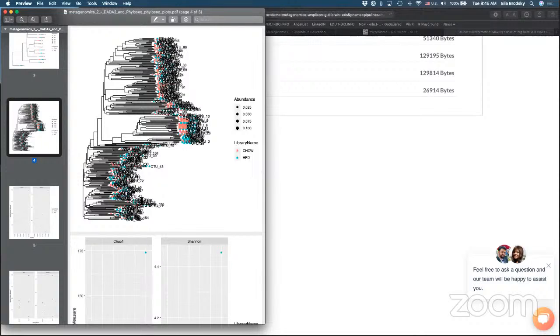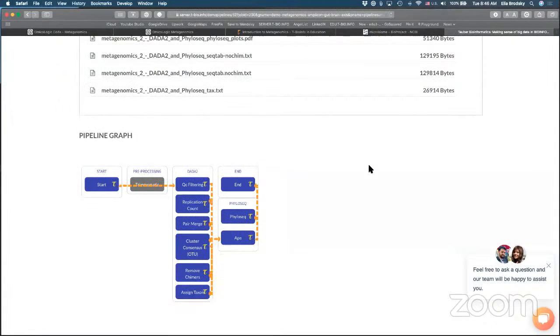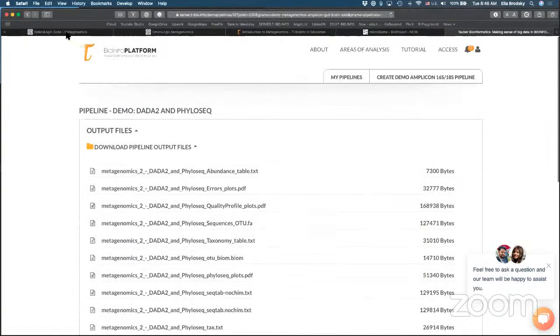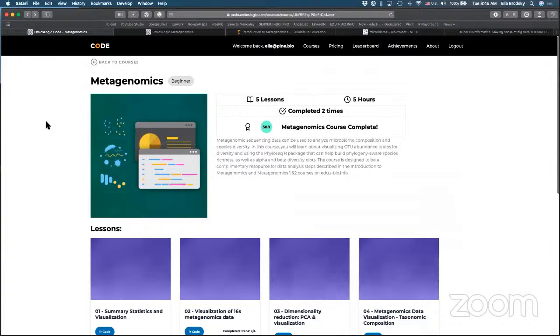This resource is a package in R that allows us to learn a little bit of R to understand what is in our data. Bear with me. At the end of this process, I think you will really understand what you can get out of this kind of metagenomic sequencing data. Please go with me to this link.